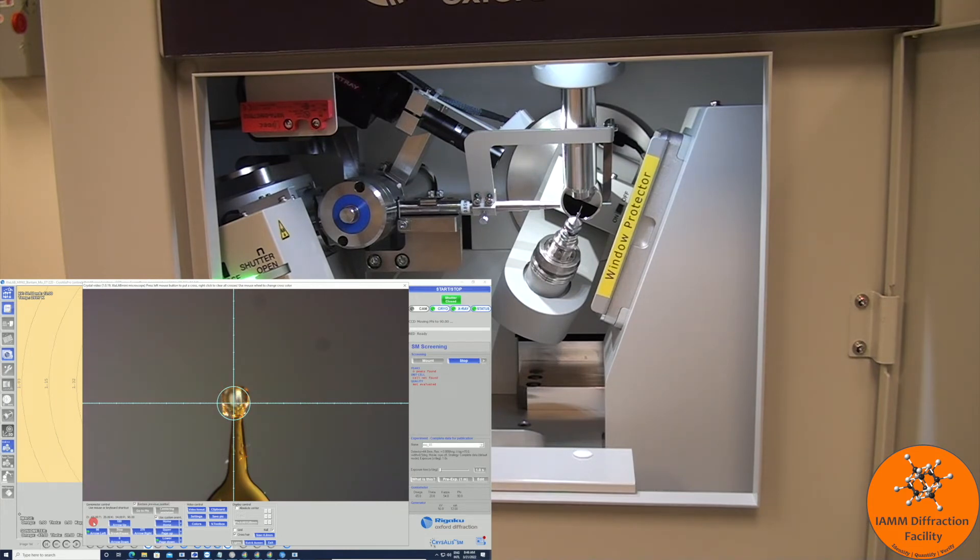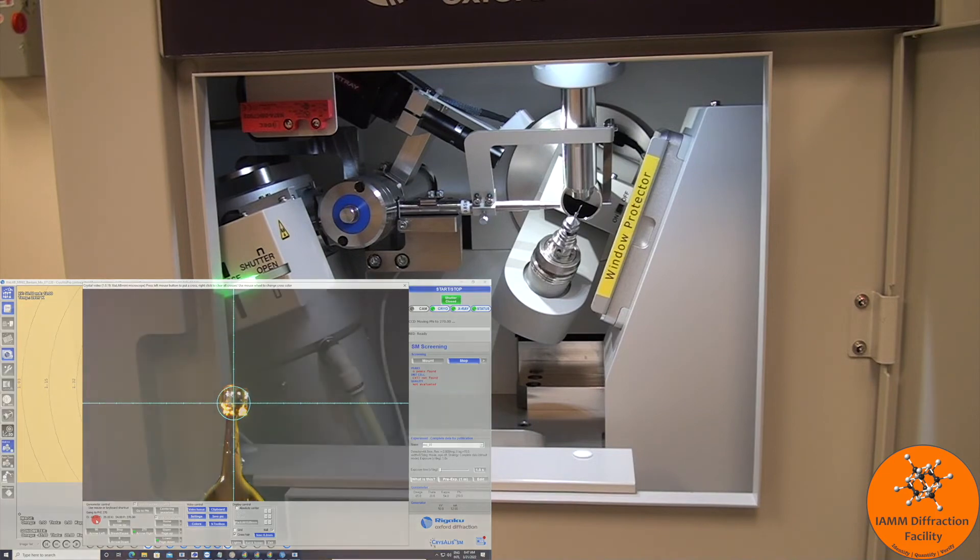If I want to rotate again, I might go 180 degrees, which is arrow up on the keyboard. I think that's looking pretty good, so I'll next do the right to see what that looks like. And also pretty good.